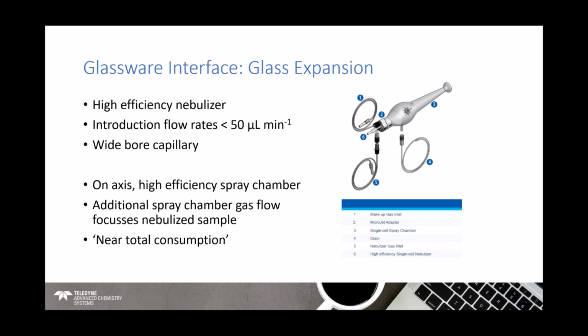Total consumption nebulizers run a bit slower than this, but it's not that far away. So this is a near total consumption process. The majority of your nebulized liquid, your droplets and your cells, the majority of that is going into the ICP-MS.